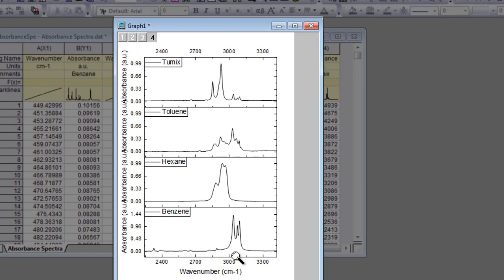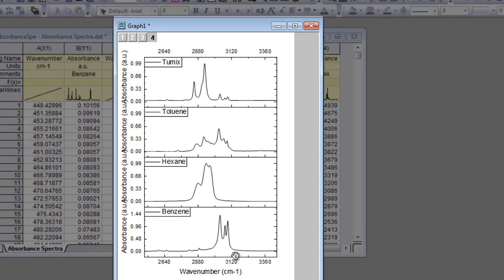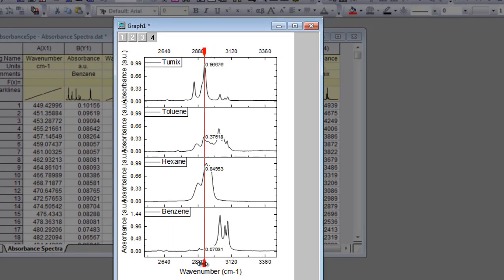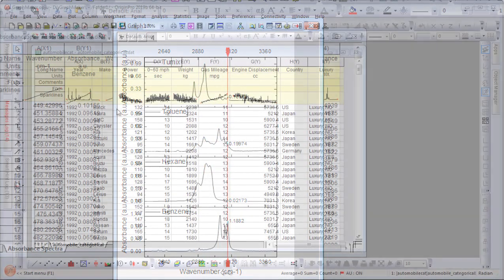Zoom and pan into the axis scales to interactively explore your data. Use tools such as a vertical cursor to read values.